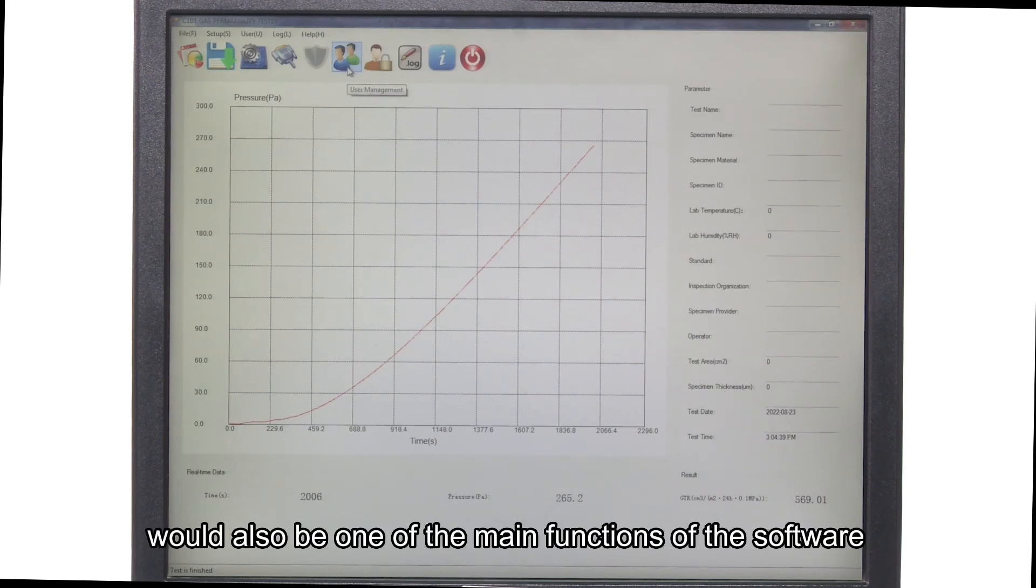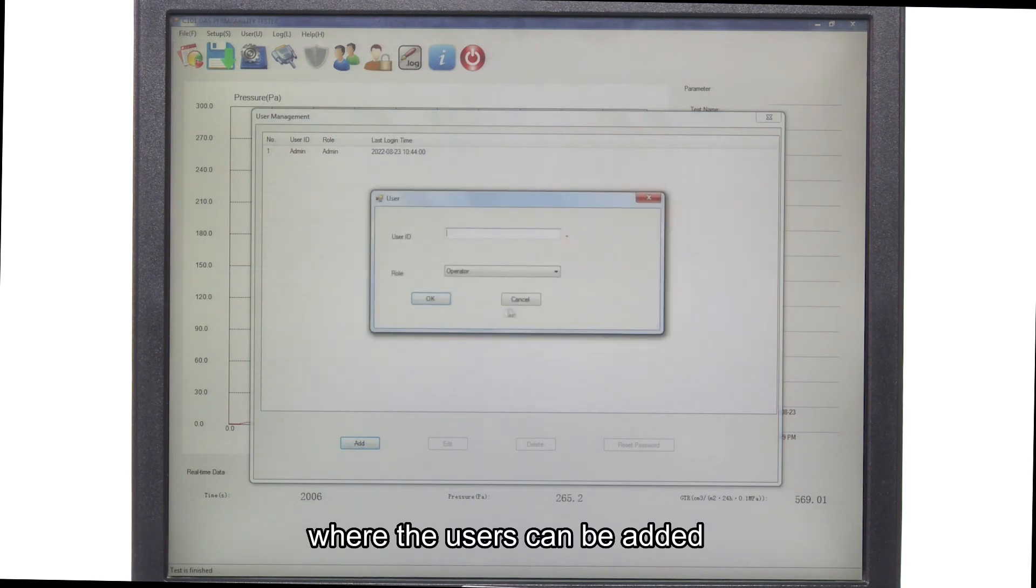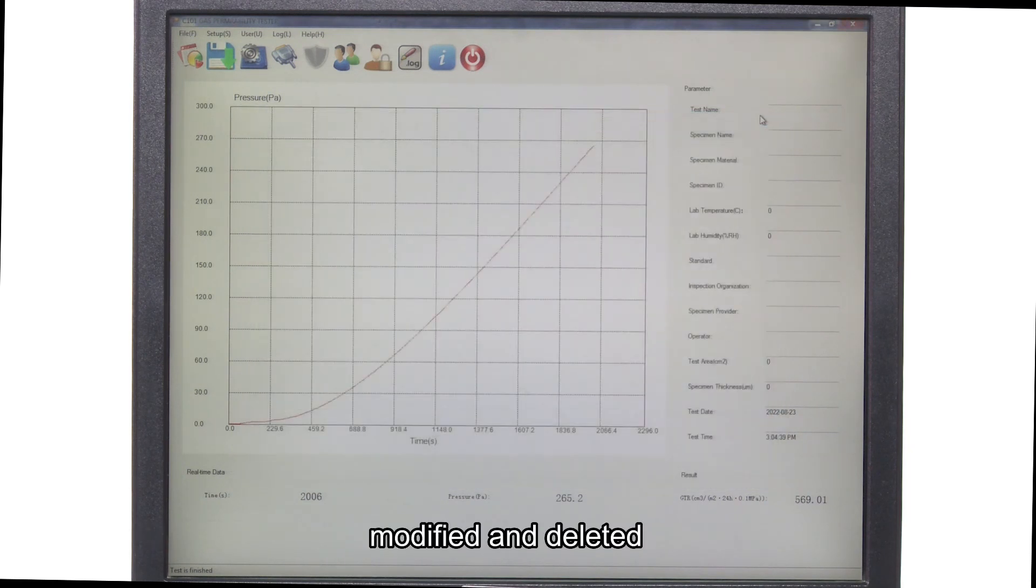User management would also be one of the main functions of the software, where the users can be added, modified, and deleted.